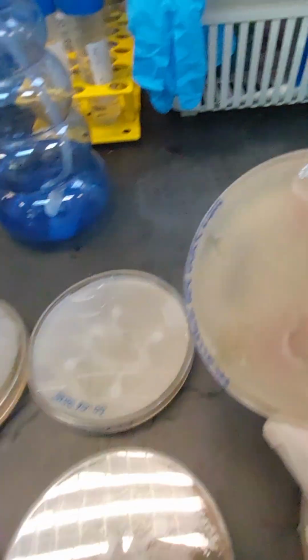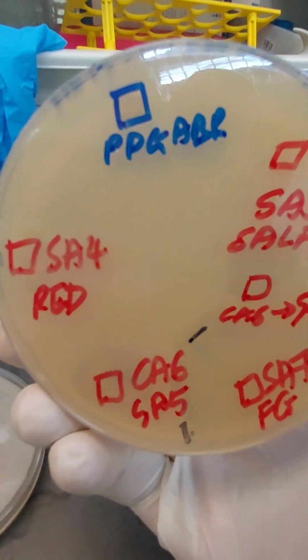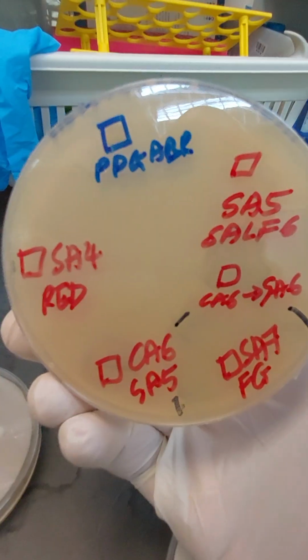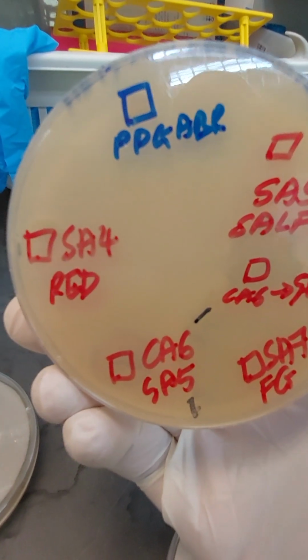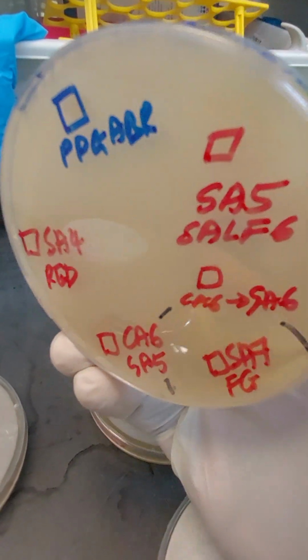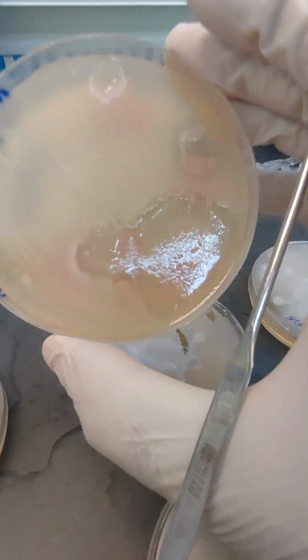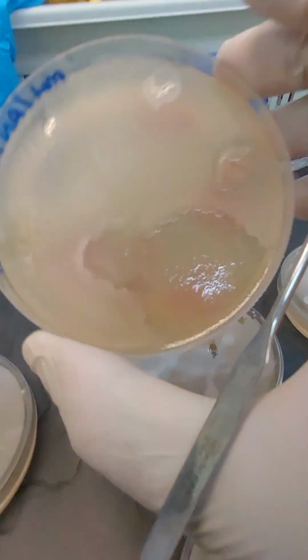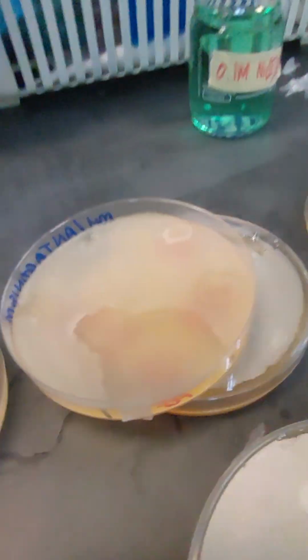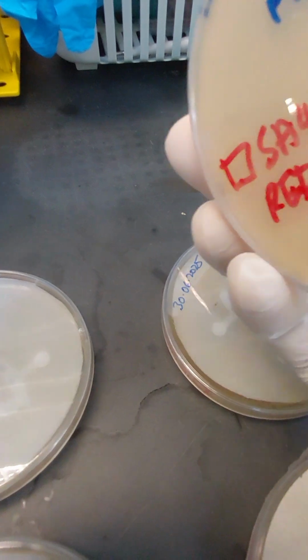Now I extended this to another experiment on Mueller Hinton Agar, in which I tried to check how these microbes will actually work against each other. So microbes, in addition to being inhibited by antibiotics, they will also be resistant to exudates produced by certain microbes. Let's look at this. Okay, look at this plate and you can see a clear zone here. Okay, this is the clear zone. You can see it over here. Okay, there's no growth.